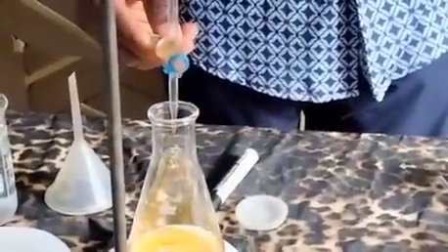We'll go to the titration. You see it's still intact. And we'll level it to 0. Remove the acid container and keep it away. Bring a white tile. But we're going to use a filter paper as an improvised white tile for accurate color change. Keep it under, and then bring the conical flask. Open the tap. Allow it to go slowly.